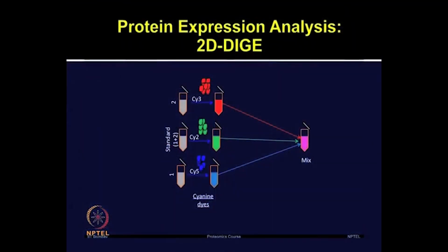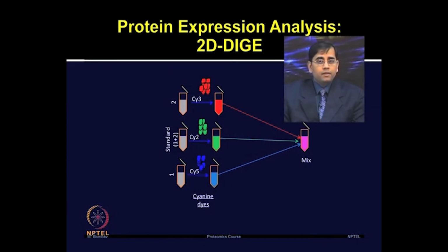They used patients with two different grades based on the Gleason grading system, which is used to help evaluate the prognosis of men with prostate cancer. Depleted serum samples obtained from patients with Gleason score 5 and Gleason score 7 were used for comparison and further analysis.